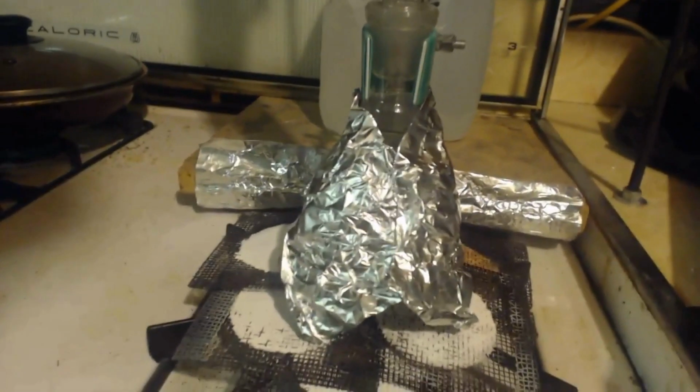Still have a lot to distill. It's all pretty much there. Only a little bit so far has come over. We'll see. Hopefully we got at least some chloroform in there. Alright, it's still coming over at a 7-second drip rate. So it's coming over real slow. But anyways, it's coming over at 44 degrees now.